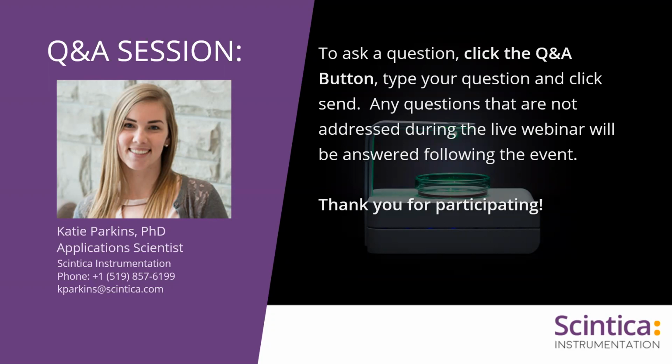That being said, if you really didn't want to use internet, you could store a limited amount of data locally. Got it. Because there may be situations where specific institutions or companies would not want it connected to the internet, and I think we've encountered that once or twice. Yes, that's right. The cloud is done through Microsoft Azure, so it's very, very secure. So there's no issues there, but depending on each institution's or each lab's preferences, we can configure it in a way that is best utilized for each group.